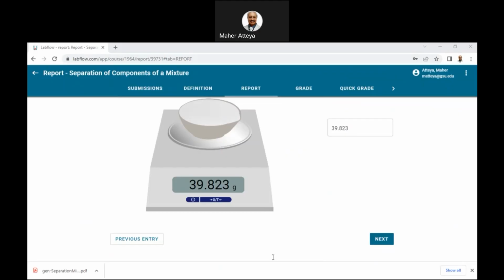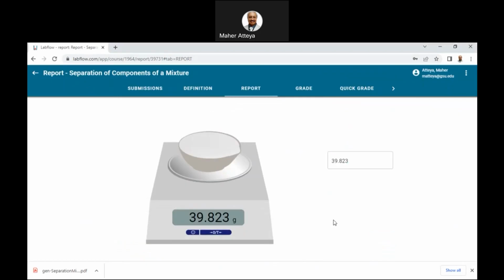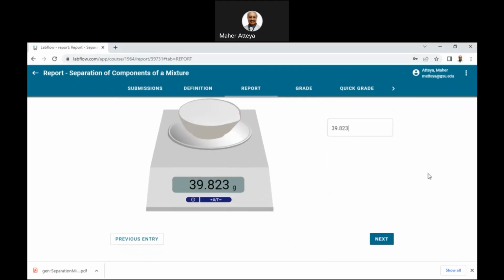So I'm entering this, I'm clicking next. So therefore, you can see here that I have, so here it is.